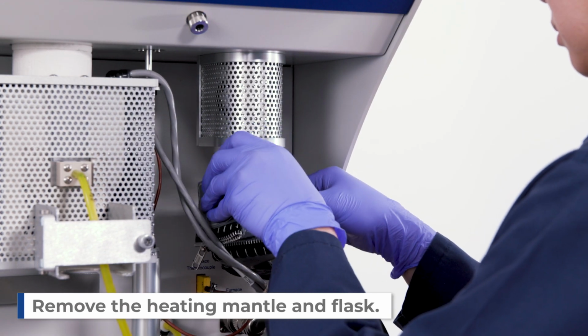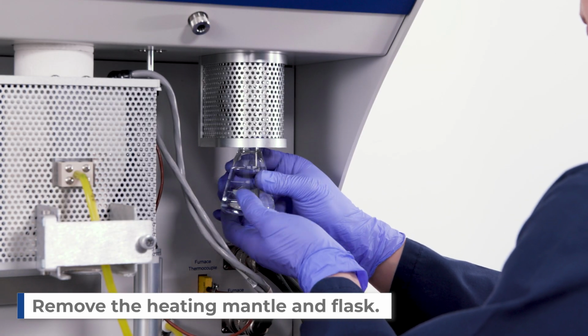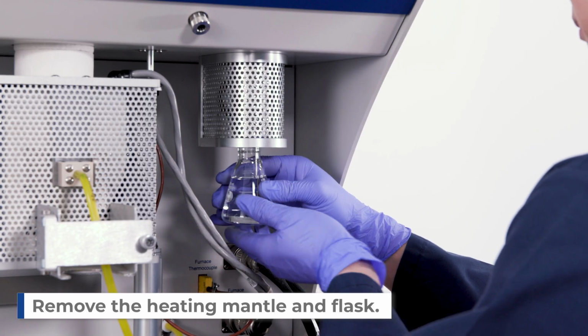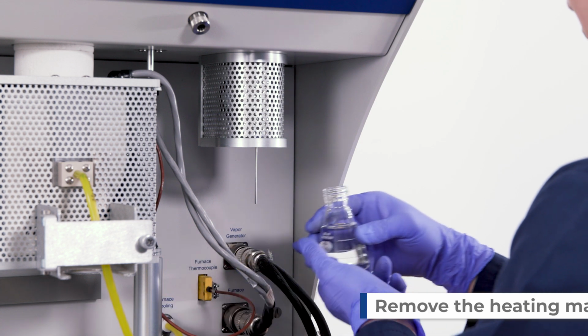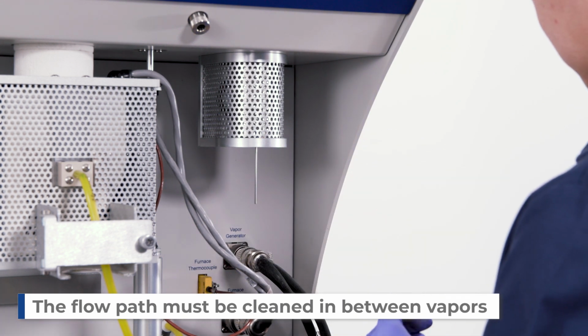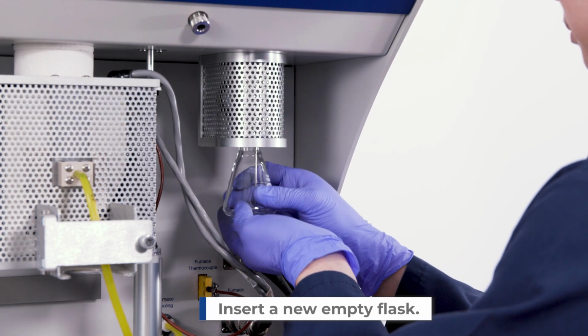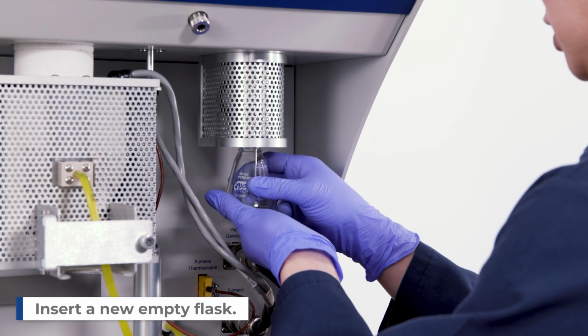Ensure that the heating mantle is disabled and has returned to room temperature before beginning. Remove the heating mantle and the flask containing the previous analysis vapor. The flow path must be cleaned in between different vapors. Insert a new empty flask.